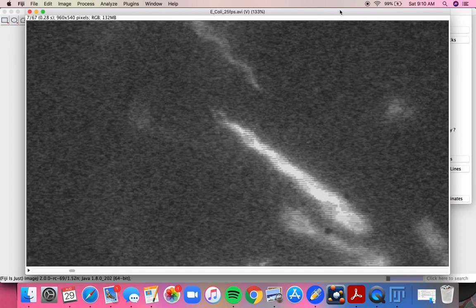With that said, I wish you luck. I hope this is fun and interesting, to see these microscopic videos of white blood cells and bacteria. Remember, the white blood cells' job is to find and destroy the E. coli. All right, so without further ado, go ahead and enjoy this experiment.